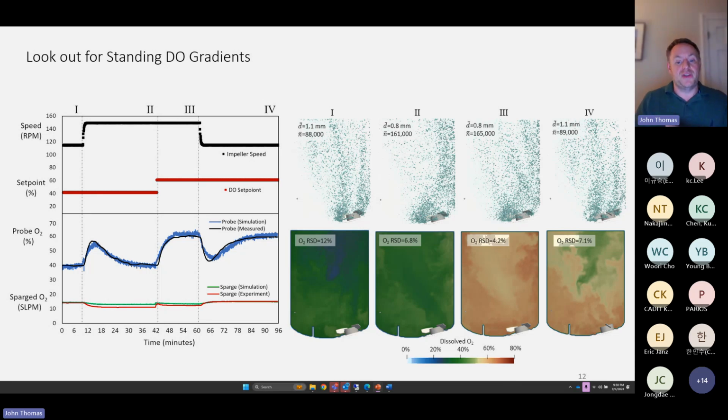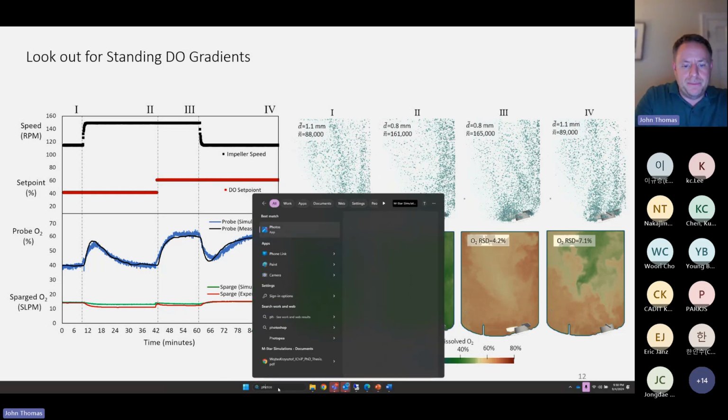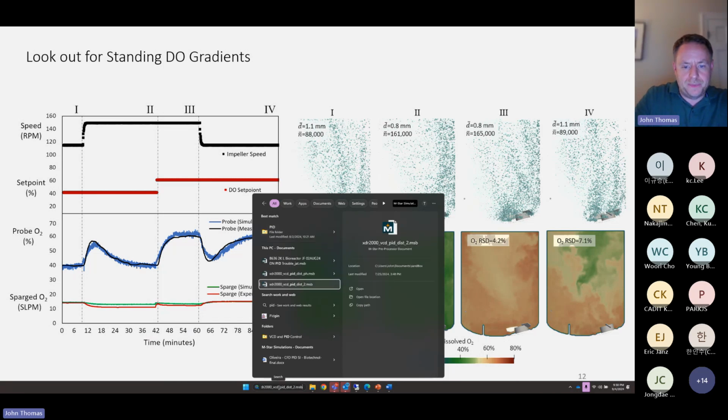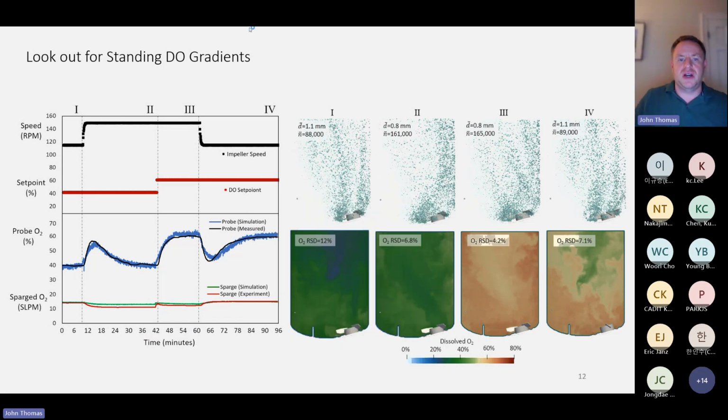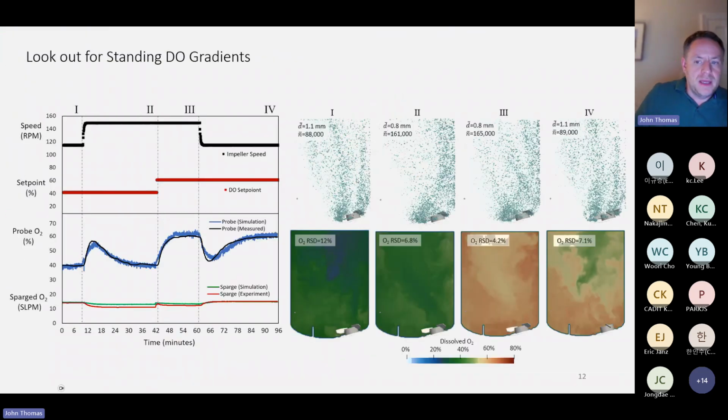I'm also happy to send out the actual MSTAR models that we use to develop these codes, because foundationally, they're pretty easy to use and not particularly challenging. I'll call these up. We can step through them later should we want to.